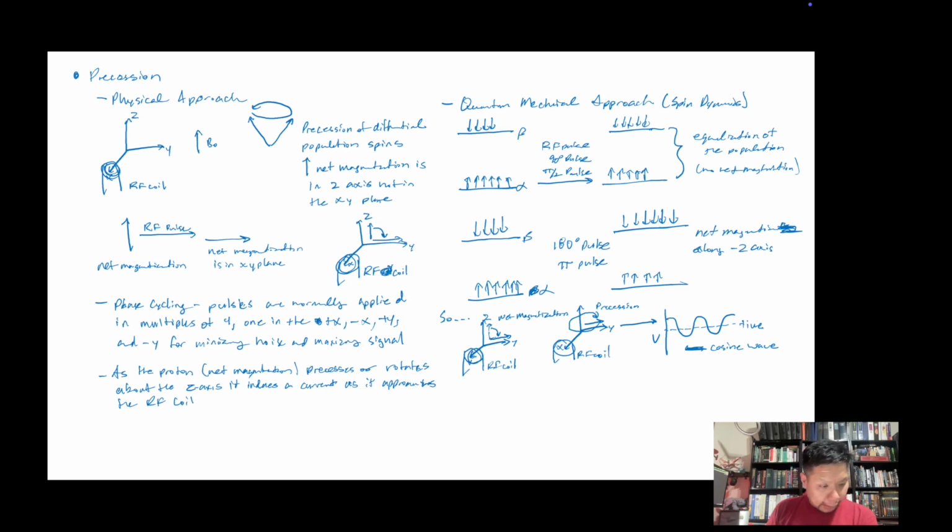All right? And then the rate that the proton is precessing, the rate of precession, and thus its frequency, is equal to the nu for the proton.